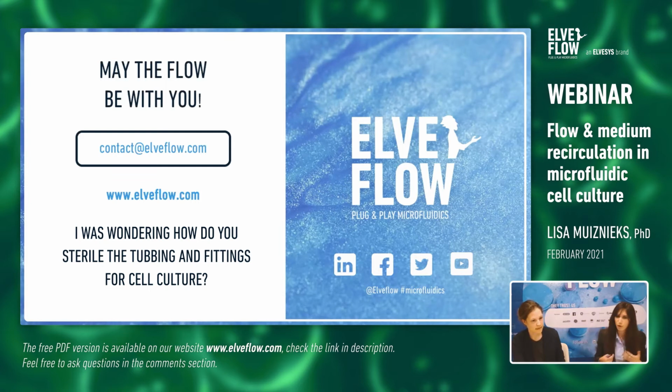What you can do for tubing and fittings eventually is to soak them in Anuzyme, a disinfectant, for 30 minutes, and then wash with water, ethanol, and air dry. So you can use this procedure. Otherwise, it's always recommended to change the tubing between each experiment.